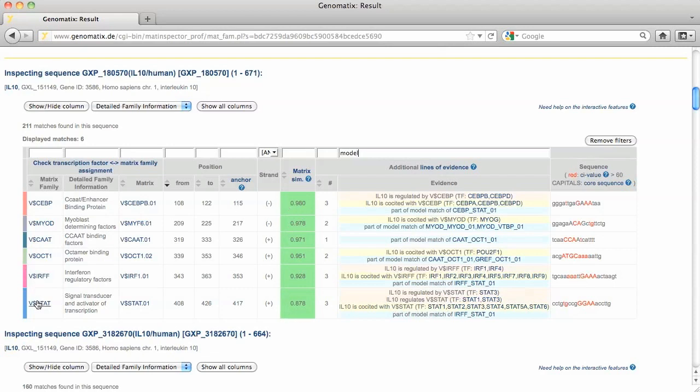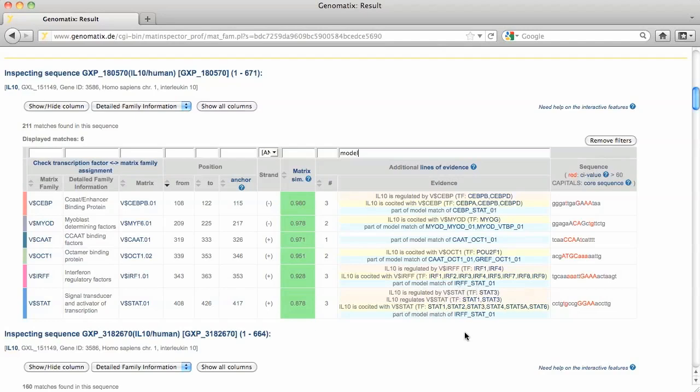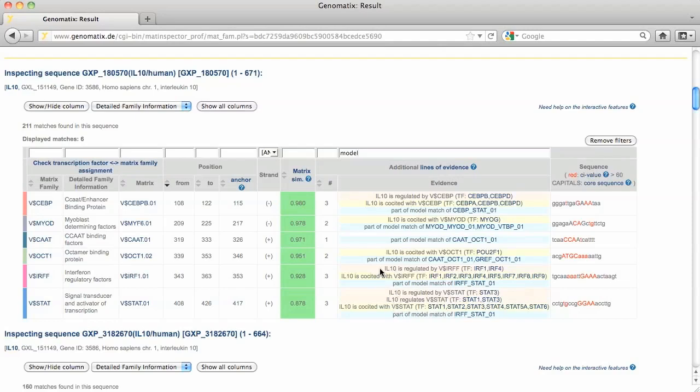In contrast, the IRF and STAT matches at position 353 and 417 are both part of the same model match. These matches are also both supported by co-citation and functional evidence.